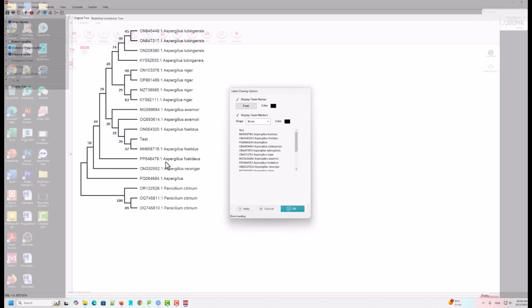This one is the species which I sequenced, and I want to show the exact phylogenetic position of the species. So here you can highlight your own species of choice. You can highlight more than one. So what is the method to highlight the species?